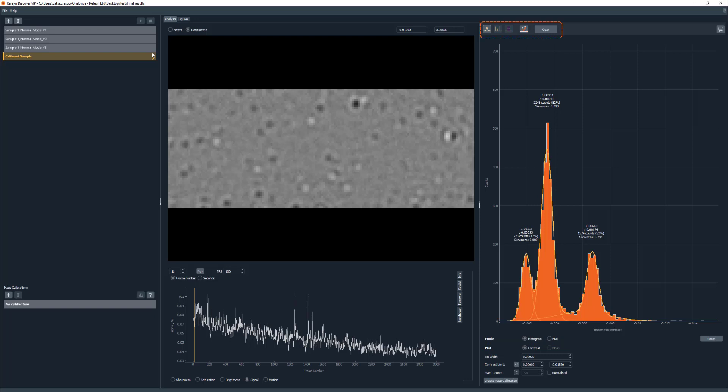On the toolbar above the plot, there are four overlay types you can apply to your data: Gaussian fits, vertical lines, intervals, and automated peak fits. When first analyzed, most measurements will display the automated peak fitting by default.